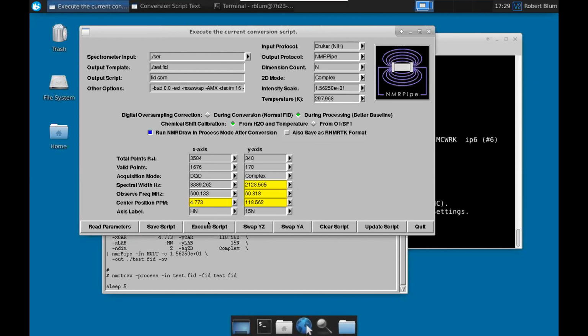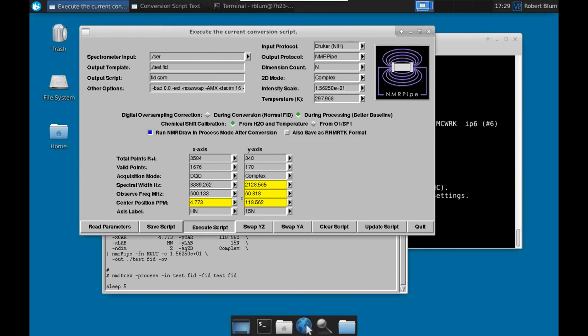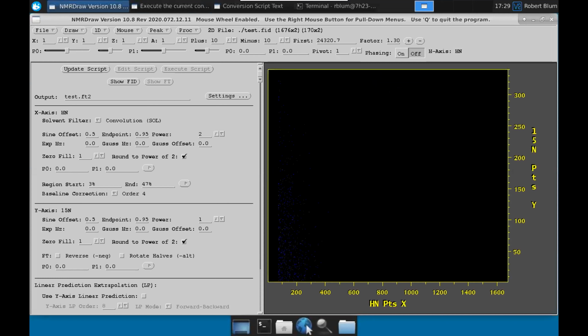It looks like your screen resolution is kind of low. Yeah, it's because it's on my laptop. I could put it on my other, better monitor if I need to. We'll do our best. All right.